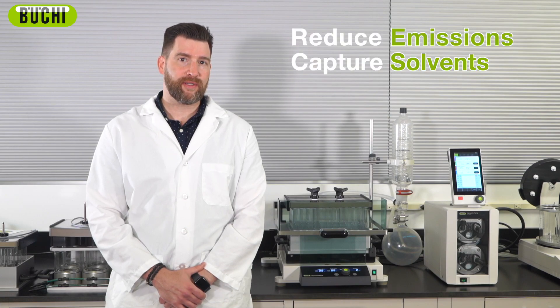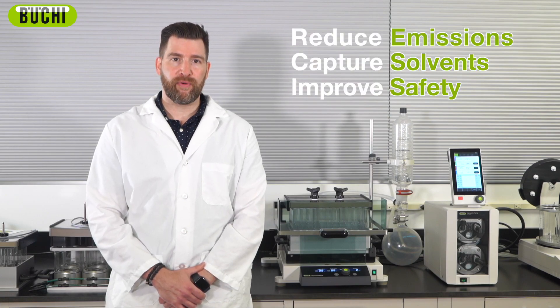The sustainable benefits of Buchi distillation include reducing overall emissions, capturing your solvents, and improving your process safety.